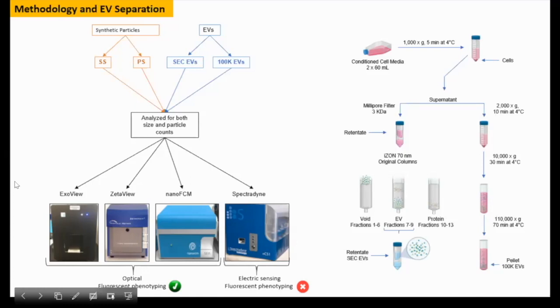On the biological material side, we used EVs that were isolated from 2 well-characterized cell lines with unique tetraspanin profiles. So our first cell line was the human H9 T lymphocytic cells, which are high in CD81 and low in CD63, while alternatively, our human U937 promonocytic cells are low in CD81 and high in CD63. So these unique profiles were able to help us quite extensively when it came to utilizing the fluorescent features of the platforms and then with the single particle analysis of things.